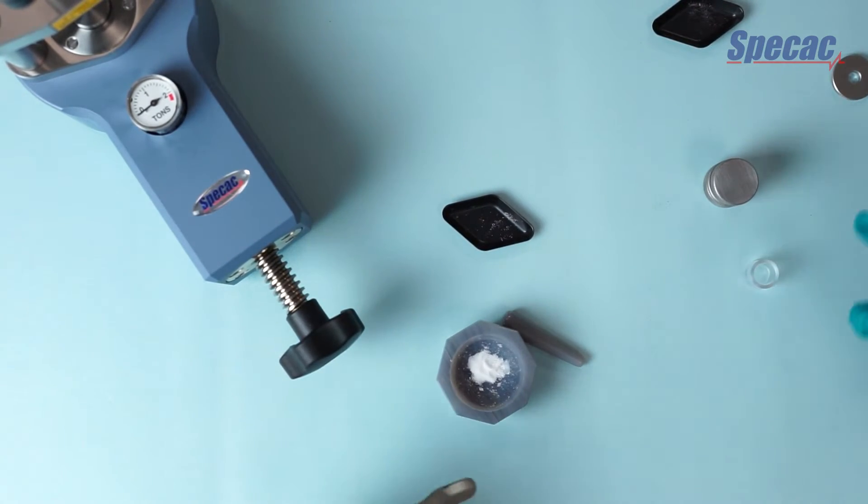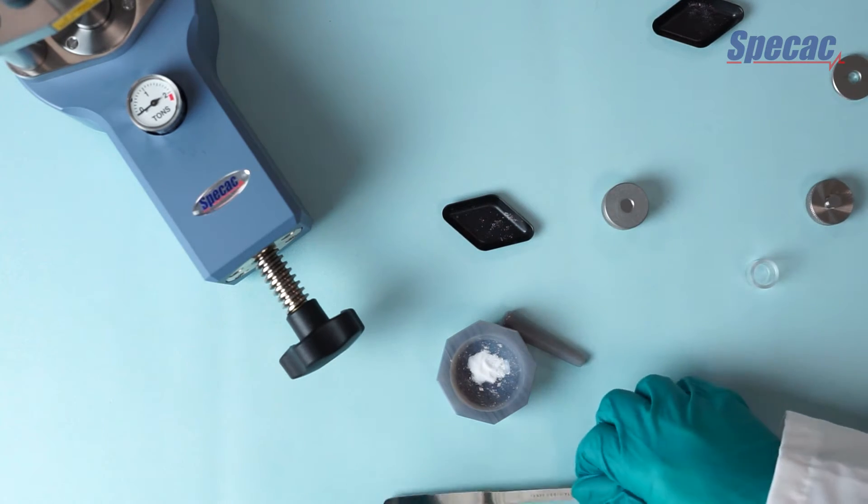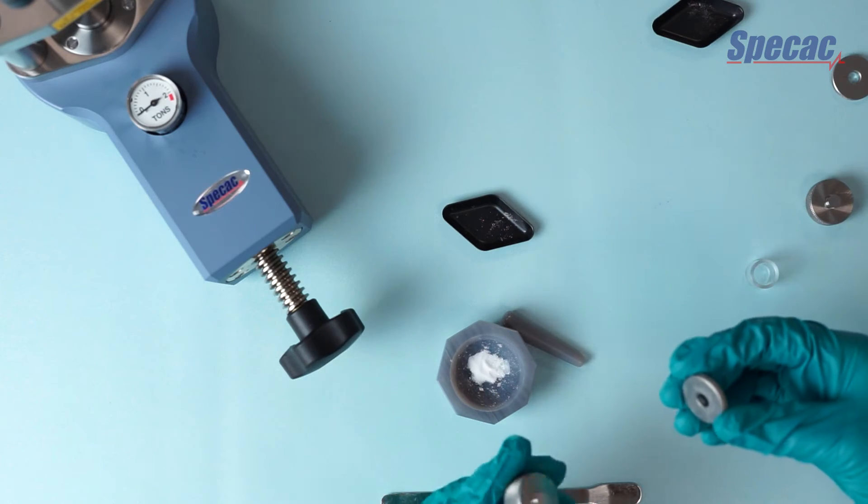When we're done with that, we assemble the pellet die, which consists of three parts. There's a lower anvil, which is identifiable from its recessed underside. There's a top anvil and there's a ring holder.